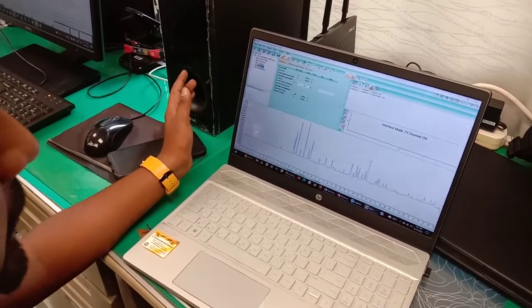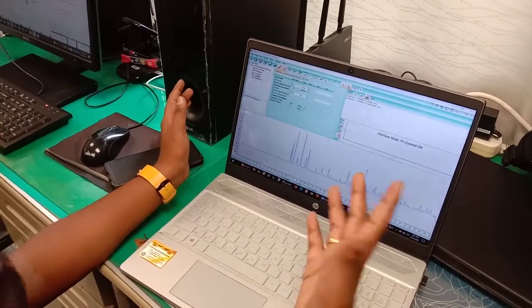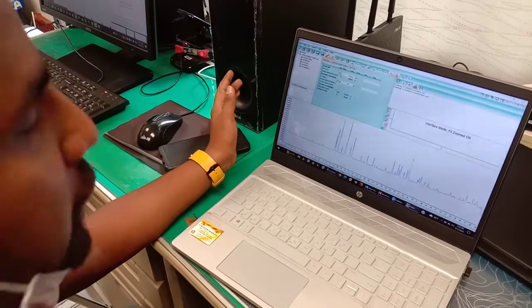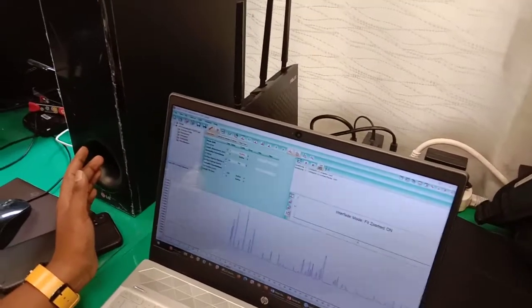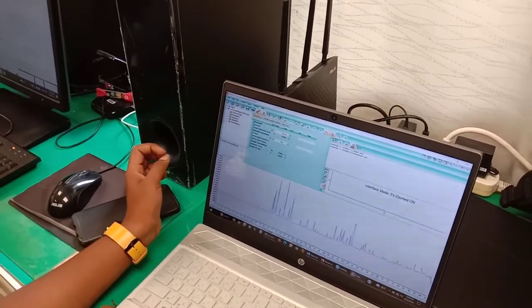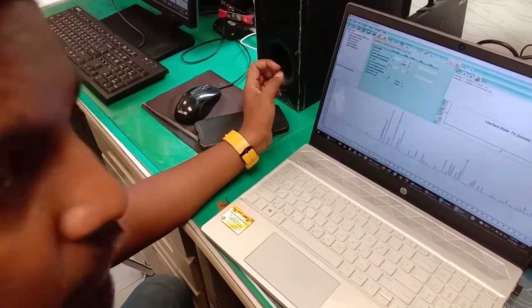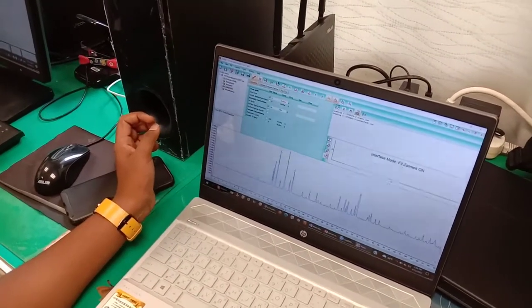Then you have to set the corrections. We are using the synchrotron, right? So the error will be 0, so you say 0 error. If you're using a second floor XRD, the sample will be displaced, so there you cannot maintain the polarization, so you have to choose sample displacement. And the LP factor is generally called the polarization factor. The X-ray source in synchrotron is actually polarized, which means it is directional, calibrated for particular incident angles. But in second floor we don't do such that. So for LP, for synchrotron it is 90, for our in-house it is generally 0.